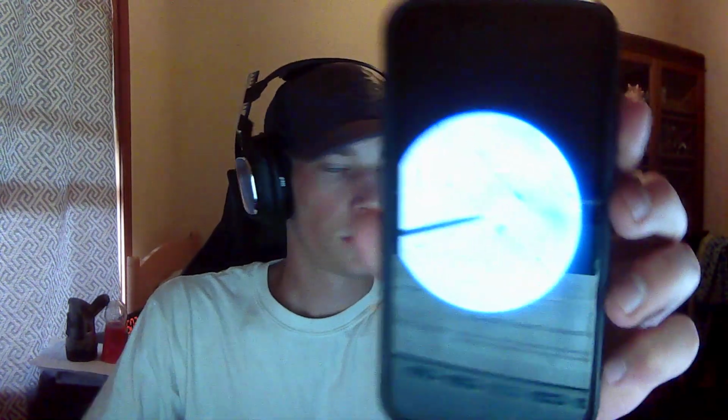Moving on to the cheek smear real fast before I get into real life applications. Here we go. There we are. So there's a cheek smear.